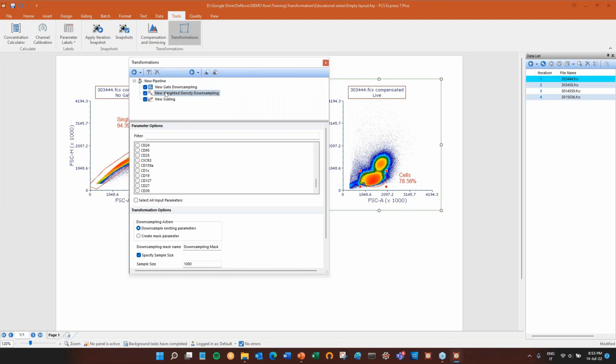If you're running the interval or the random sampling, then you can put it upstream. That's fine, because interval and random downsampling do not rely on distances. Okay, this is a good example of thinking that you need to do when deciding where to put the steps.